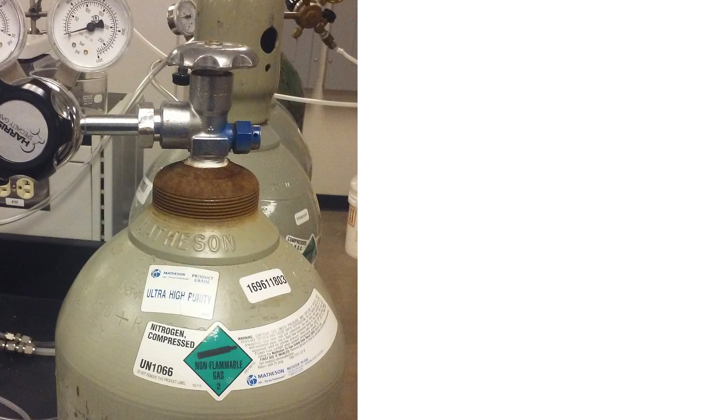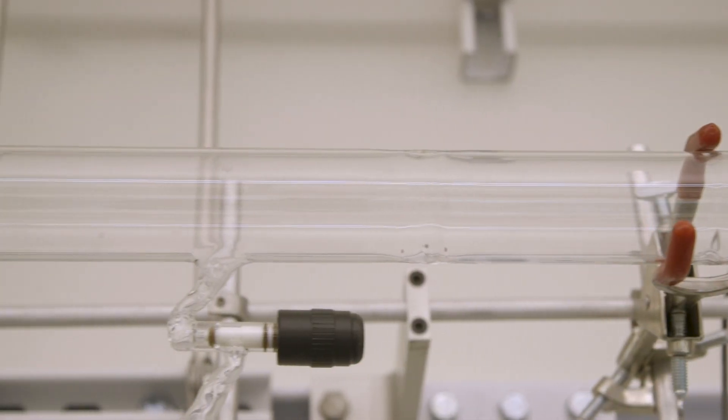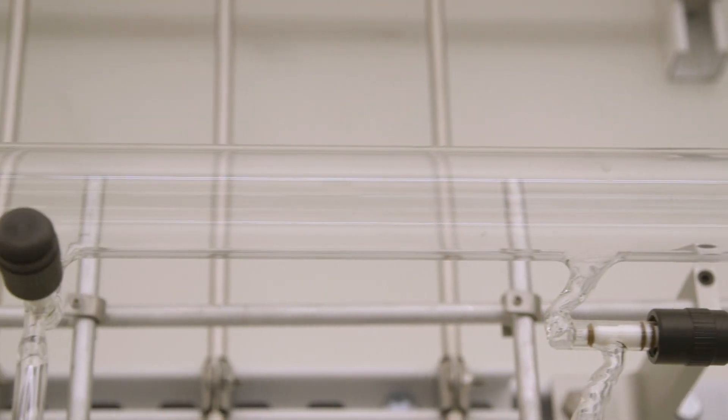Schlenk lines come in a variety of shapes and sizes and serve different purposes. There are Schlenk line variants that use positive pressure and do not require a vacuum pump, removing the vacuum hazard from the system. Schlenk lines can either use nitrogen or argon gas, but argon is preferred. Consult with ASU-EHS regarding Schlenk line modifications.